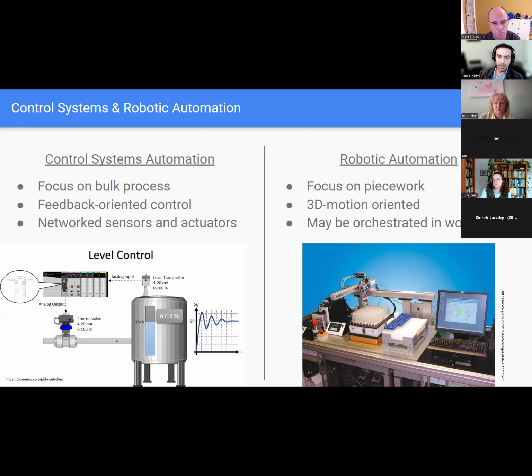And then often the way that we do this is that we say, well, I have a single robot, but in fact, I need to integrate it with many things. And so, as you get bigger and bigger, you need to have it talk to some sort of orchestration service so that two robots can work together or a device can be utilized. And we'll get into that. But I just wanted to lay these two out because these papers kind of go in and out of both of them.